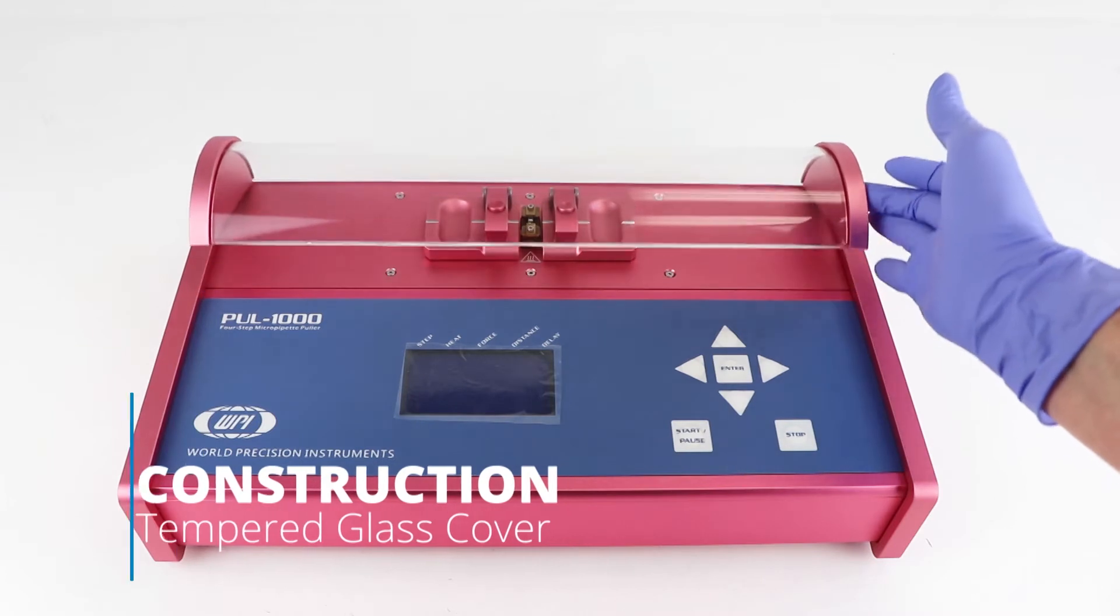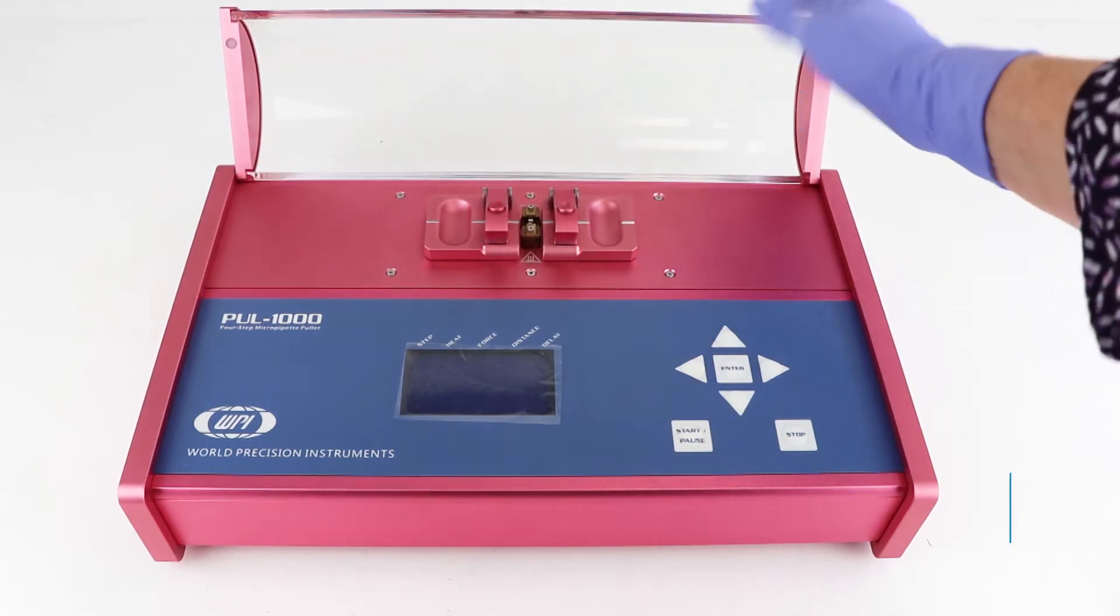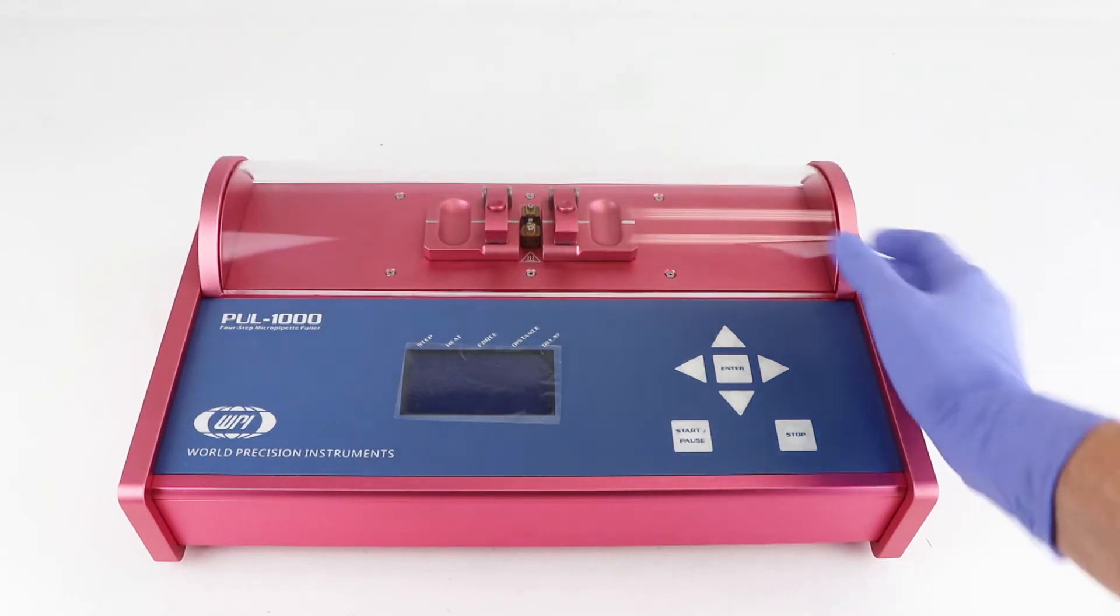The cover of the pulling chamber is made with tempered glass to minimize the effects of humidity and air currents on the reproducibility of pulled pipettes.